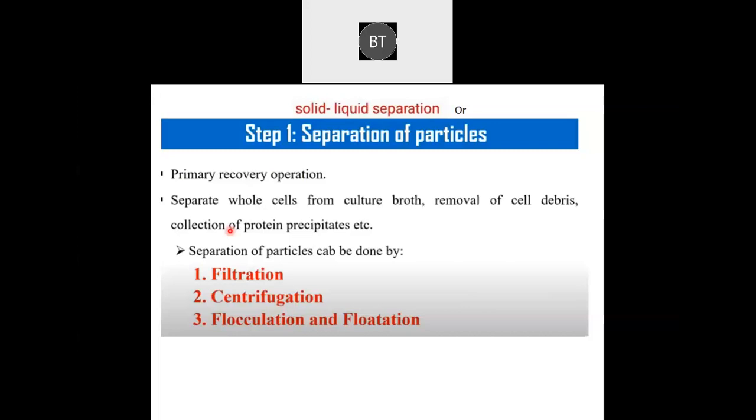So the separation of the whole cells and the insoluble ingredients from the culture broth is known as the separation of particles. In the fermentation, as we have already told, we will be adding all the nutrients required for the organisms, and the physical and chemical conditions.